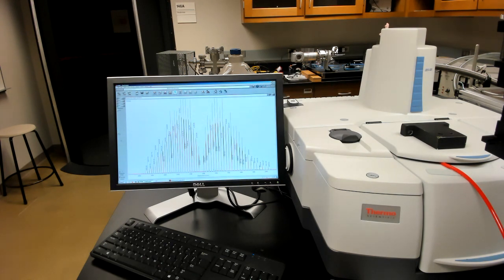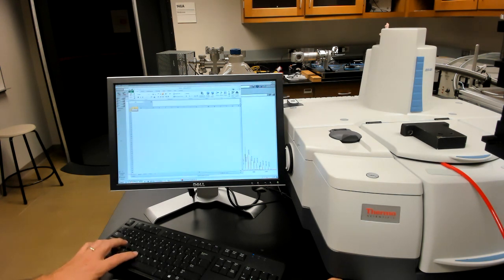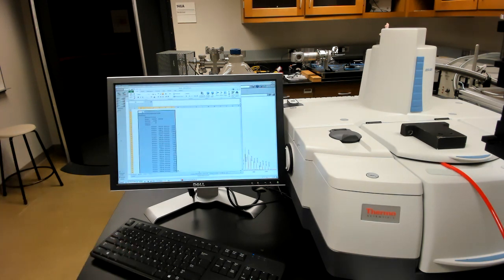Now we seem to have all of the peaks, or most of it, or all of the strongest peaks. We don't have any noise features. So now we can copy this data to the clipboard, and then we can paste it into an Excel file. If you'll hang on one second, Excel will open. Let's just click a point here, and then we can paste. So easy. All right, that's the data that you'll analyze for carbon monoxide. Let's stop there.